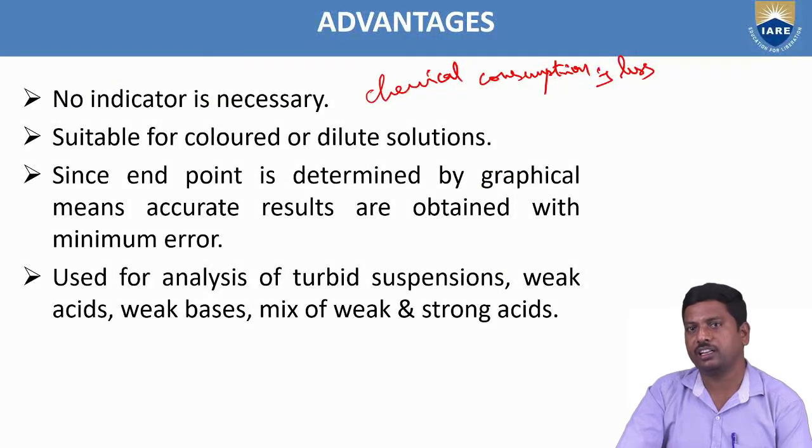In the case of a colorless solution, we can identify or view the endpoint very easily. But in the case of colored or dilute solutions, identifying the endpoint is very difficult. By using conductometry, it is possible to determine the endpoint of a reaction. That's why it is applicable to colored or dilute solutions, and the endpoint is determined by graphical means. Accurate results are obtained with minimum error.